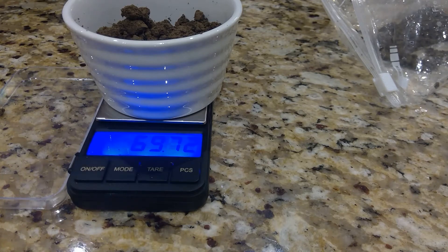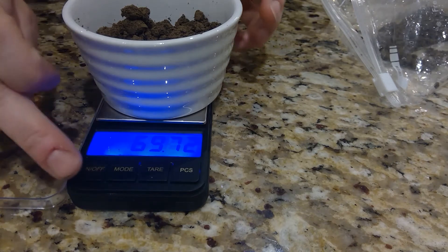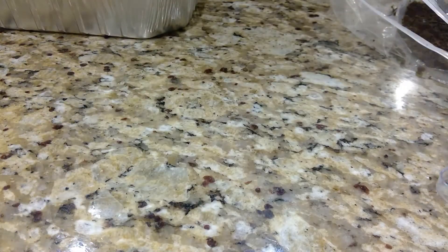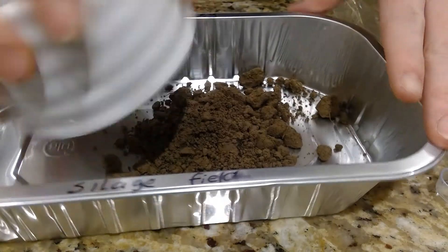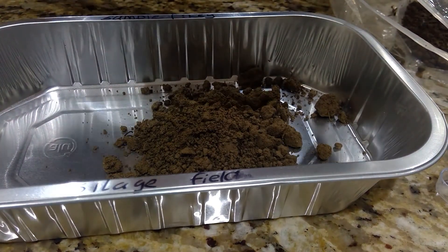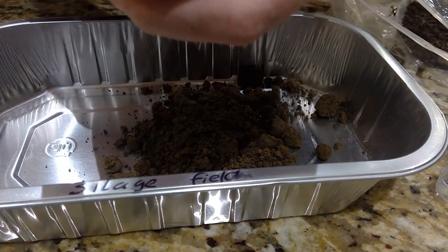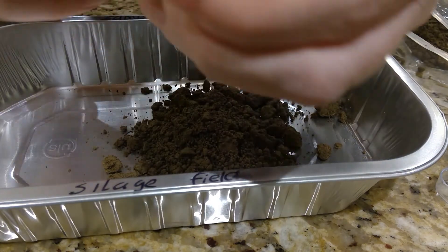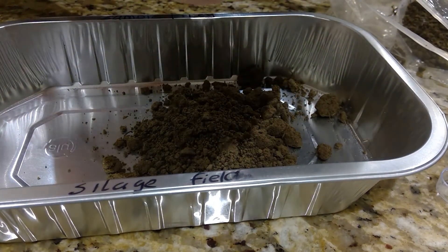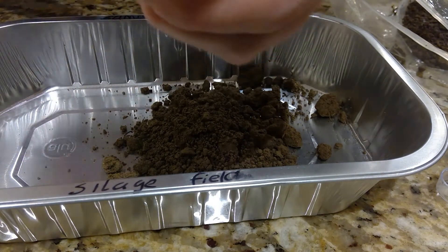I'm going to take note of that, then turn off my scales and put everything into my foil tray, making sure to get everything out of the original container. The reason I like to use the foil tray is because it doesn't take as long and the heat spreads evenly throughout the sample.